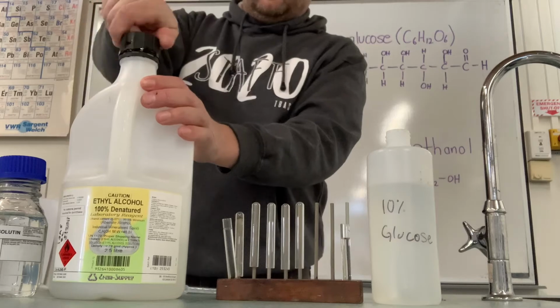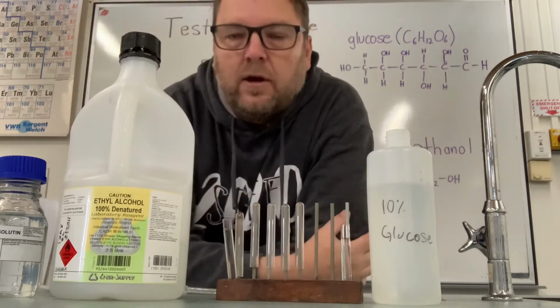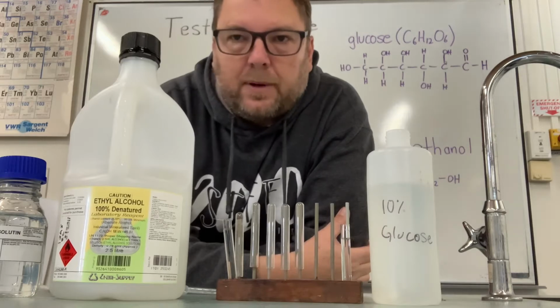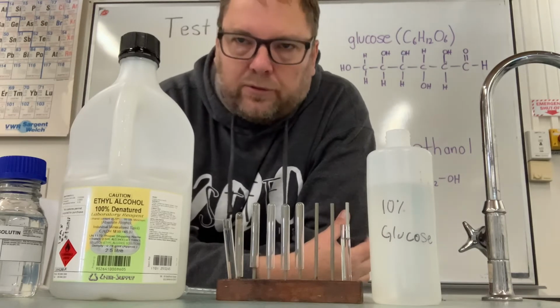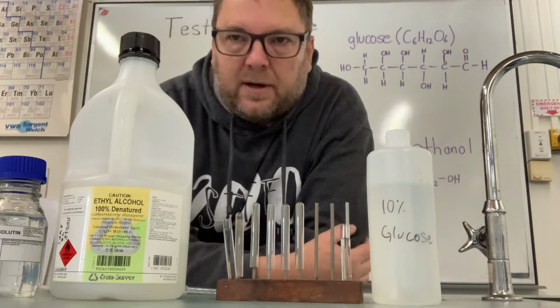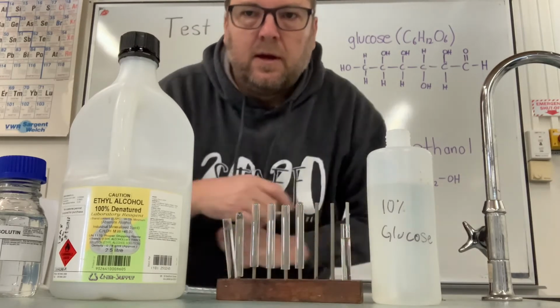And what I will do now is, first I'm going to get a beaker of warm water to put them in, just to speed the reaction up a little bit. But I'll also pause the video and then we'll come back and see what has happened after a few minutes. Cheers.